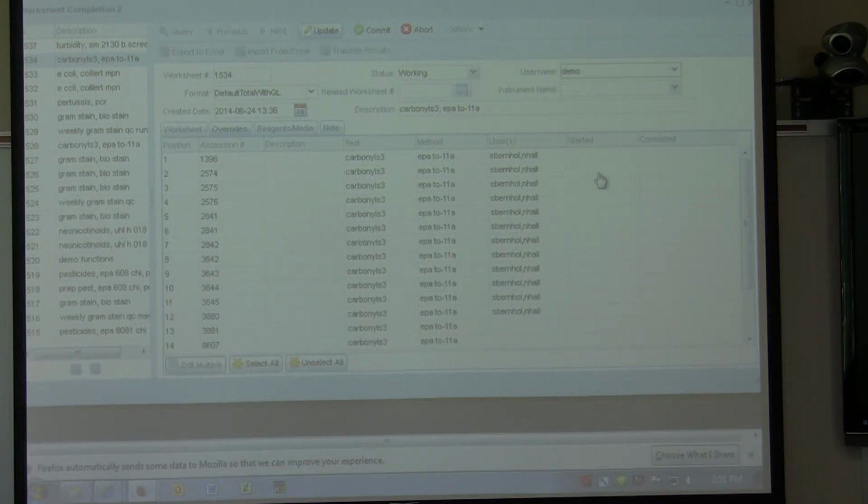Then nobody explained that to me, that it needed to be that way. I was assuming that everything you put on a new worksheet gets a started date of that worksheet. And then if it was not overriding something, that's, sorry. I mean, if it doesn't get stored anyway, it's probably not a big problem. It is now being stored, though. Okay, well, then that's probably going to have to be addressed.